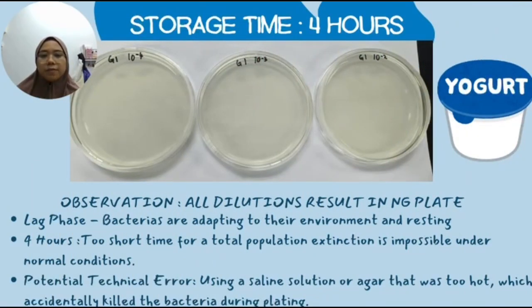This is the result for a storage time of 4 hours of yogurt. As you can see, across all dilutions, all plates result in no growth. Theoretically, this should not happen. So, why does this happen?